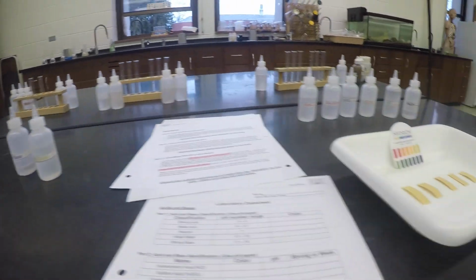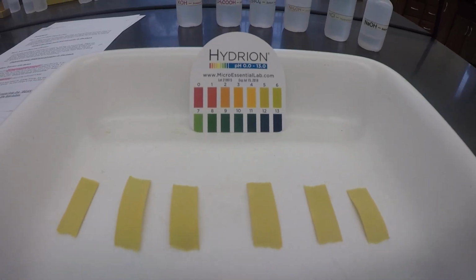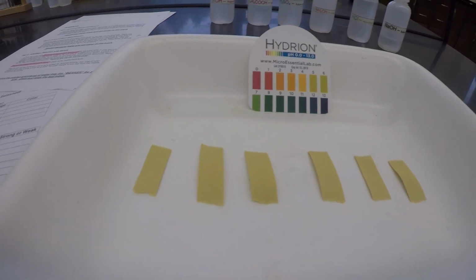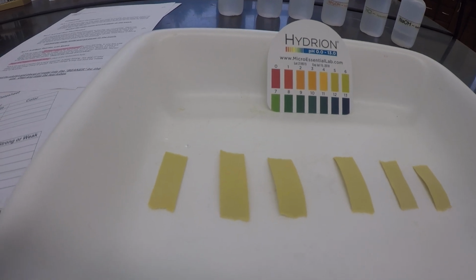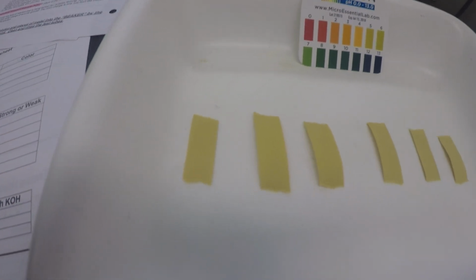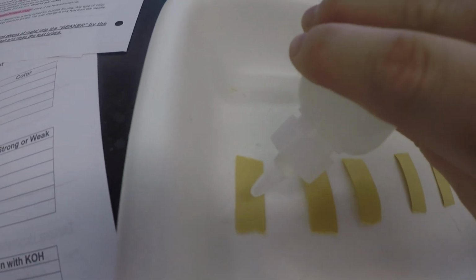Part 2 over here is called acid and base identification. I'm going to do the same thing, but I'm going to go with your data table and put a drop of a known acid or base onto a piece of pH paper. The first one I'm going to do is hydrochloric acid, onto this piece of pH paper.